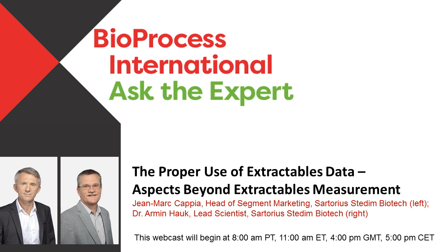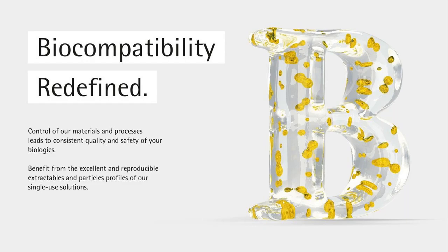So the context for this presentation is the increasing adoption of single-use systems, which is raising a growing concern for extractables, leachables, and particles. The goal for this presentation will be to show you how applying good science and stringent process control will provide well-characterized and reproducible extractables, leachables, and particles, which in turn will give consistent biocompatibility of single-use materials and components with biologicals.